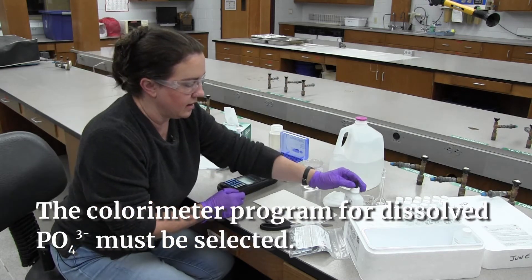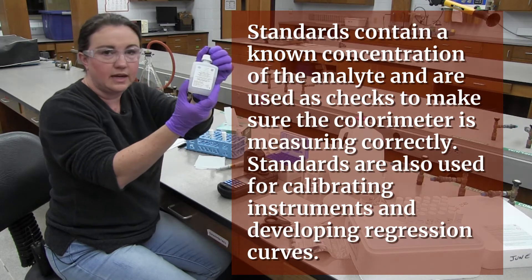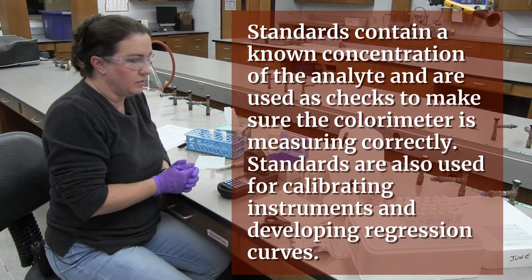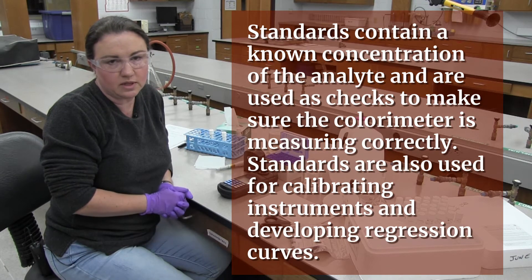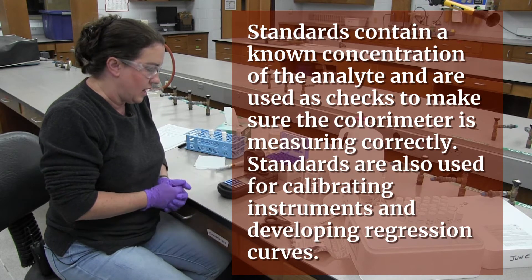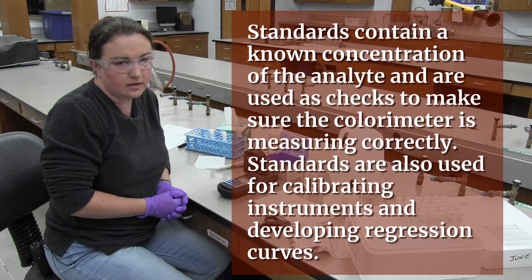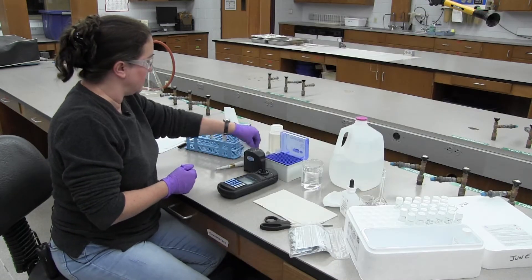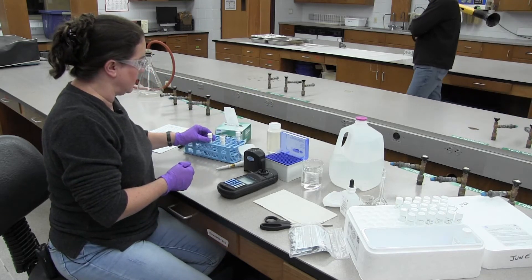I've already made up a standard from a 100 milligram per liter phosphate standard. It's not going to read 100 on the test — I had to dilute it to make a 2 milligrams per liter. This meter will only read up so far, so if you have a sample that's really highly concentrated you would need to make a dilution. We're going to see what this sample concentration will be, but first we're going to do a standard.